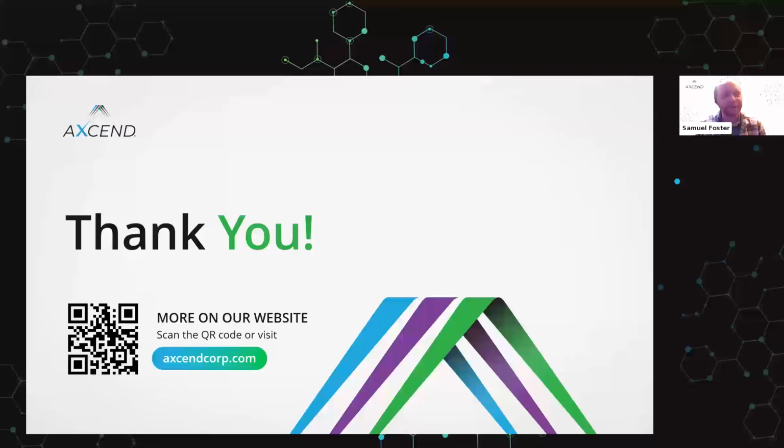I see another great question here. What are the typical lengths of capillary columns and injection volumes? That's a great question. So I have a full guide, and you can feel free to reach out to me. What you typically are seeing in terms of analytical scale is 5 to 15 centimeters, maybe all the way up to like 25 centimeters if you're doing something like SEC. I've seen monolithic stationary phases that go as high as 2 meters long, but that's much more uncommon.